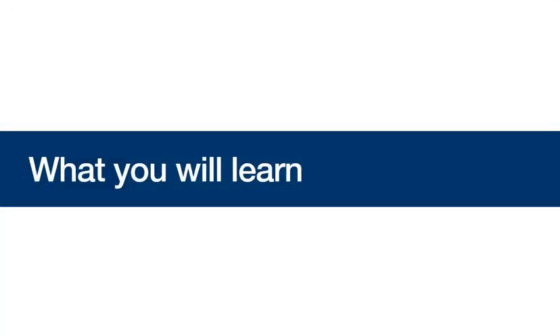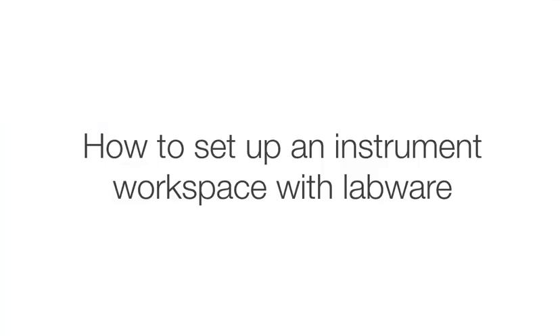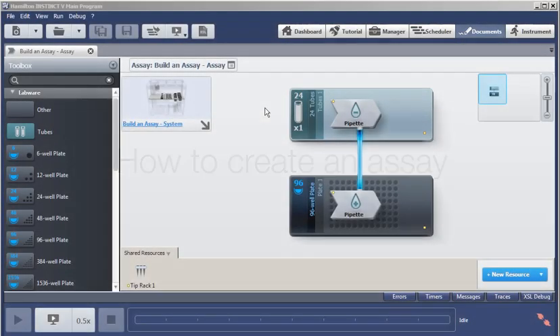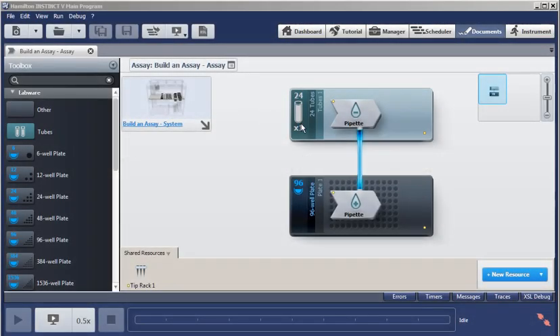Here in about 10 minutes you will learn how to set up the instrument workspace with labware and how to create an assay ready for simulation like you see here with tubes, plates, and all the pipetting activities.